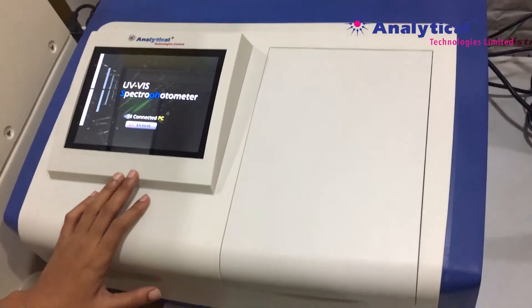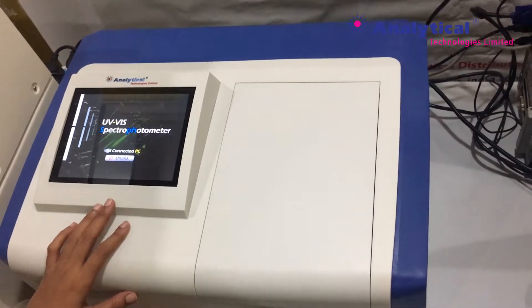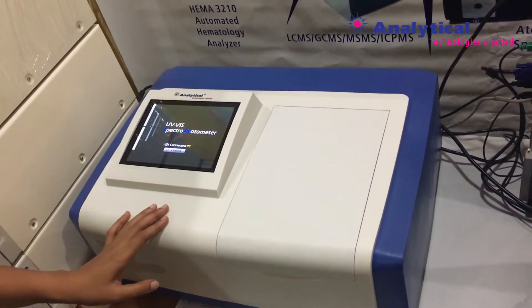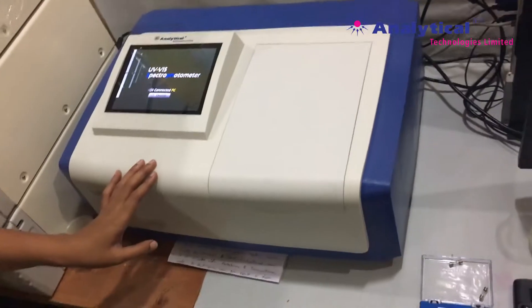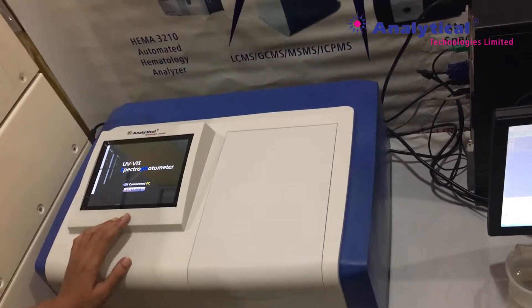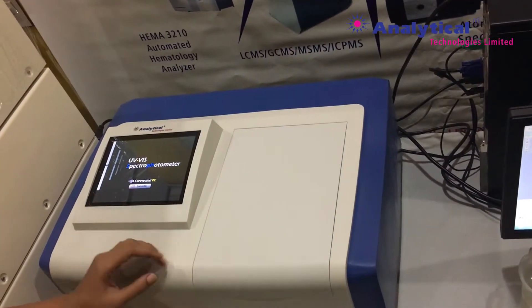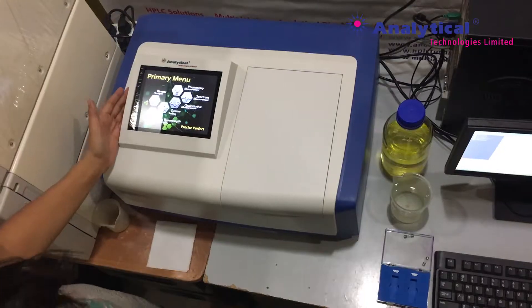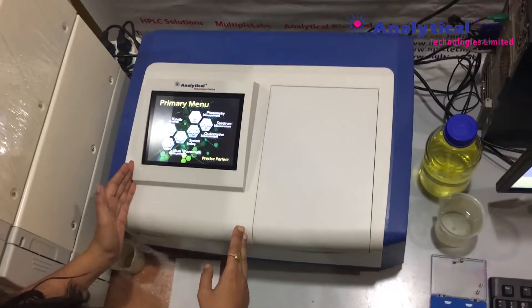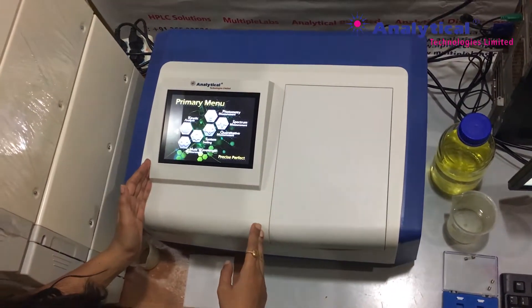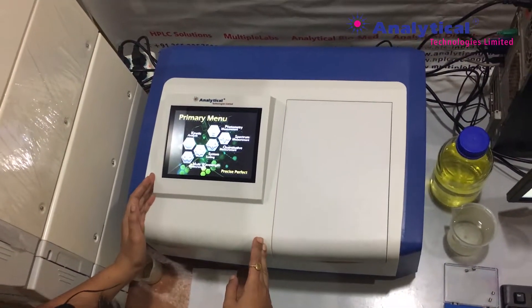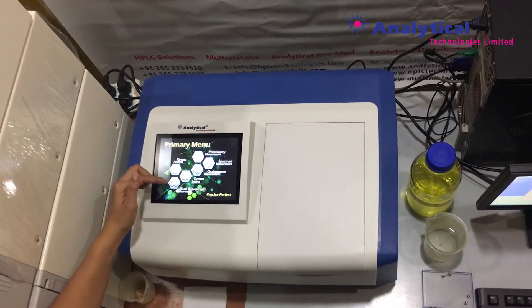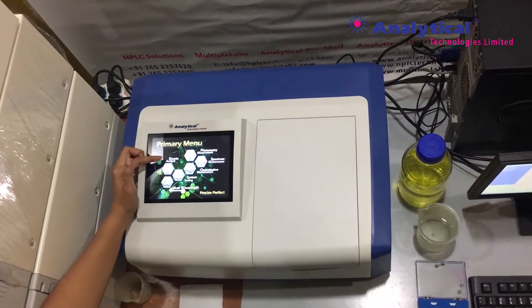As you can see, this touchscreen model provides an excellent wavelength range between 190nm to 1100nm. In the primary menu, you can find various options like photometric measurement, spectral measurement, quantitative measurement, system setting, multi-wavelength measurement, and kinetic analysis.